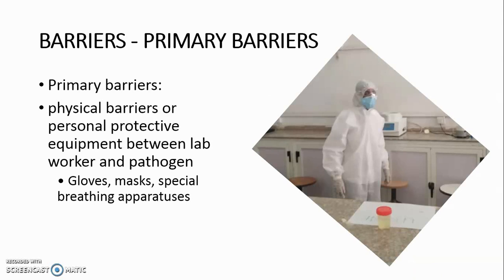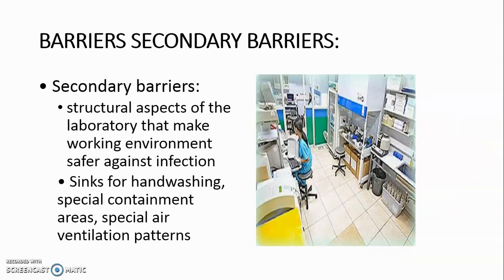Barriers are divided into primary barriers — physical barriers or personal protective equipment between the lab worker and pathogen, such as gloves, masks, and special breathing apparatuses — and secondary barriers, which are structural aspects of the laboratory that make the working environment safer, including sinks for hand-washing, special containment areas, and special air ventilation patterns.